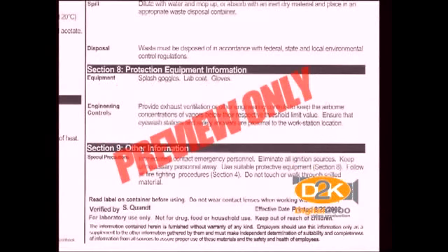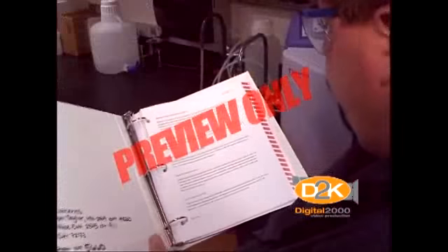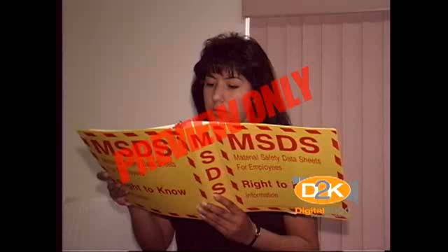This section explains special personal protective equipment to use when working with the chemical. It also describes requirements for special procedures, extra health or safety information, signs that should be posted, and other information not covered in other sections. It is wise to study MSDSs for any chemicals you will work with in your university laboratory.